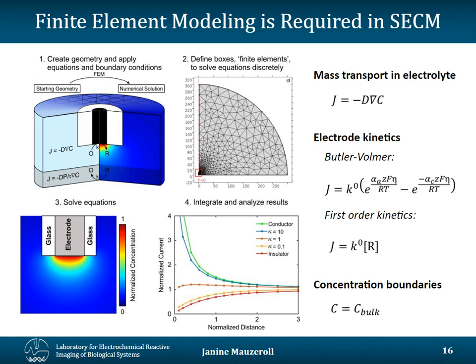But the point of this slide is to tell you that if your objective is to quantify kinetics or the reactivity of your underlying surface, it's usually not enough in SECM to just carry out the experiment. You also have to develop models in order to fit approach curves to extract the parameters.